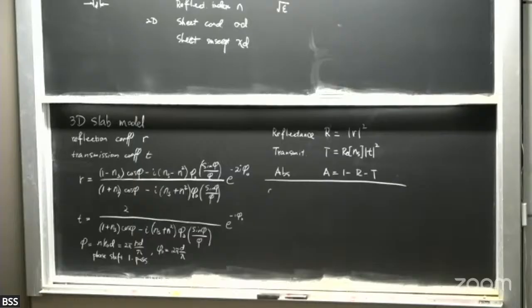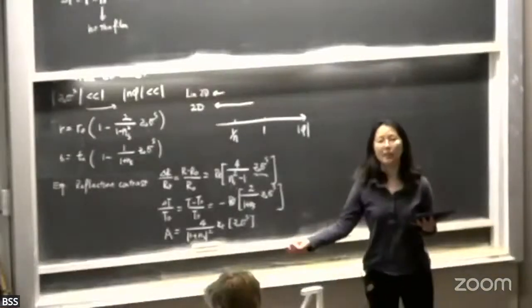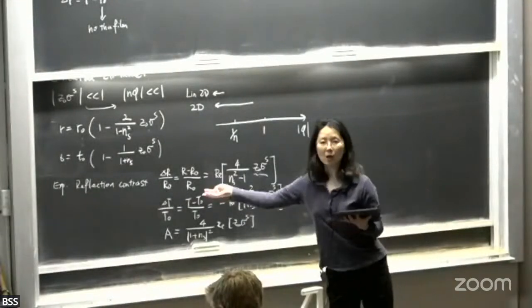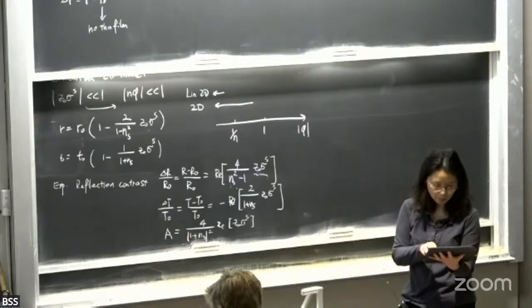Okay, so now let's get back to this experimental question. If I measure something like this, do I know whether I can use the 2D model or linearized 2D model, right? So, if this ratio is much smaller than 1, then it is safe to use the linearized 2D model. But otherwise, one needs to be very careful. So that's kind of the general idea.